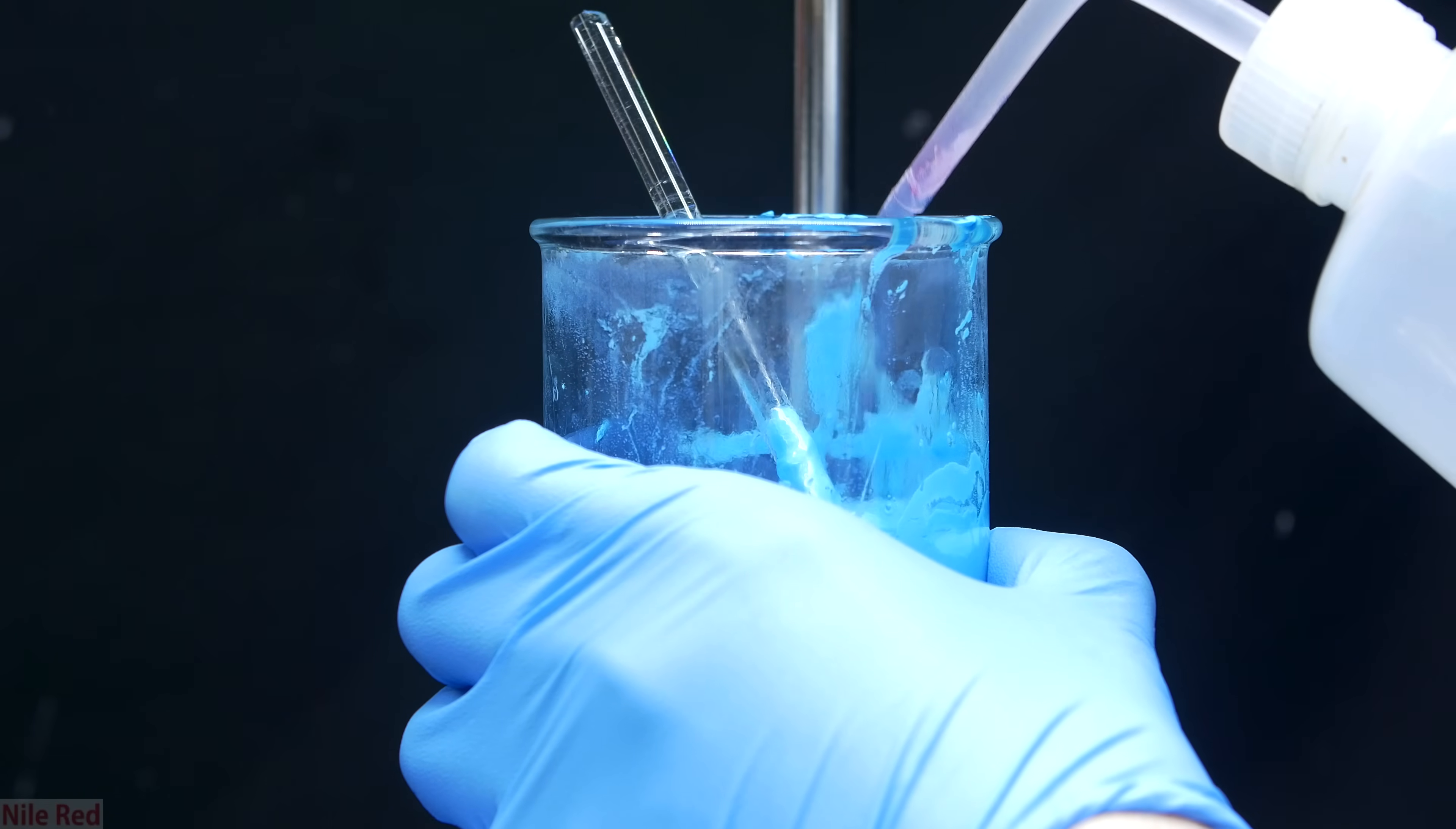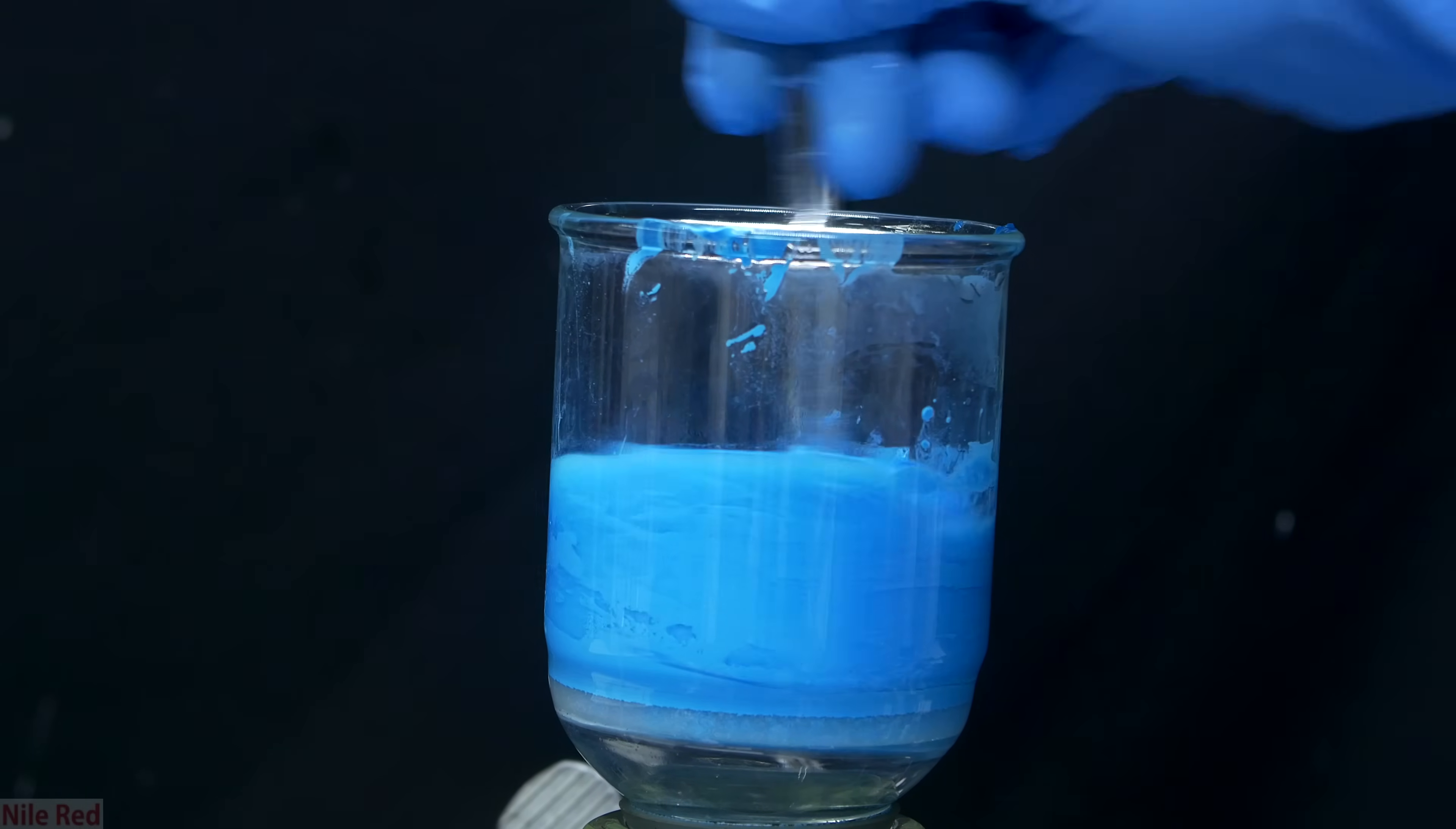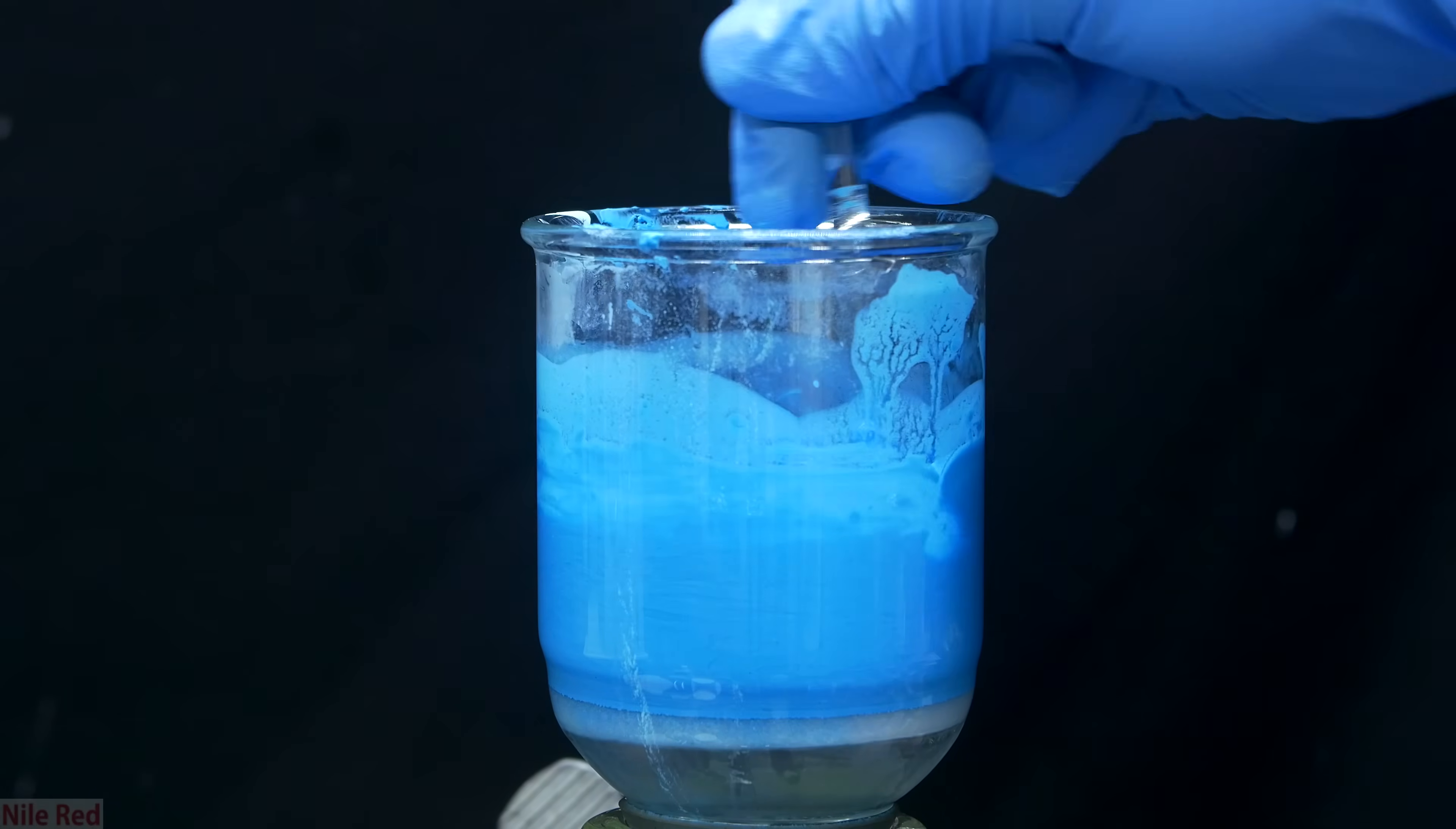Now our copper hydroxide should be relatively clean and free of ammonia and sulfate ions, but we still need to dry it up, and to do this I used some acetone. By washing with acetone we can get rid of the water, but the acetone is much more volatile, so once we're done here, we can just let the copper hydroxide sit out in air and it will dry pretty easily.